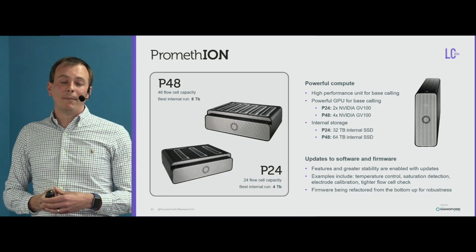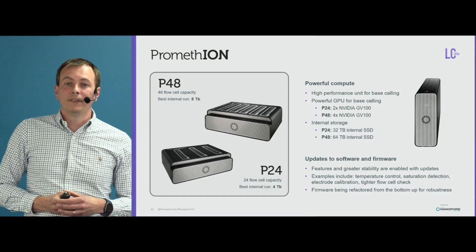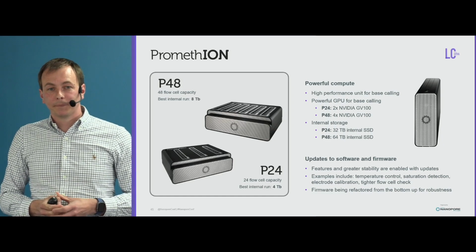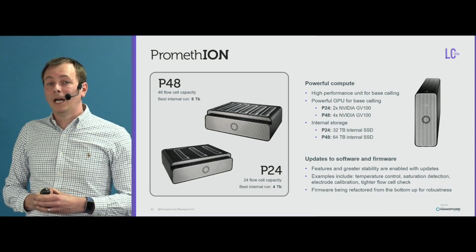Saturation detection, that's when a membrane isn't set up right and it pops under the stress of sequencing, and we have to turn that off. So that's been improved. We're probably a bit too twitchy actually, we're probably turning a few too many off.